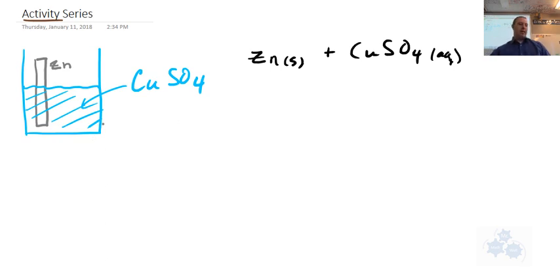And we see inside this, and I'm just going to grab it here. Which one is it? It is zinc. Okay, so here's the zinc, and what we see in there is that it was a clear, shiny piece of metal, and it's very dark and black, and we've got all sorts of things in there. The solution is not the brilliant blue that it started out as, right? And here is the aluminum. So aluminum foil in there, and we definitely have some copper inside there, and it's flaking off, falling apart.